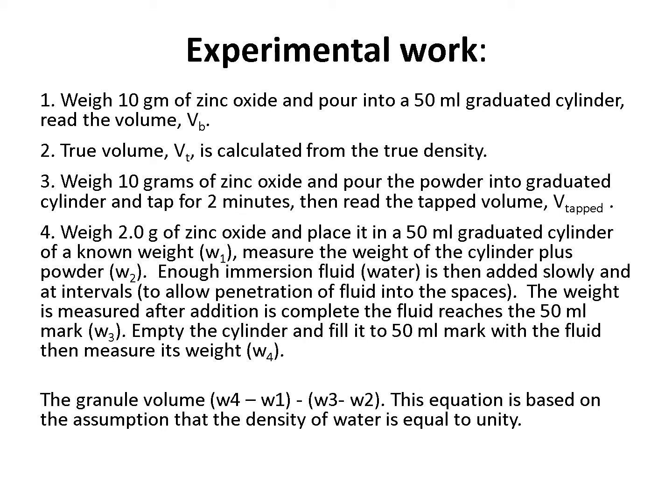Then using a glass rod, stir to ensure that all the intervoidage is displaced by water, then add extra water QS to 50 ml and weigh that cylinder. This is the third step really.